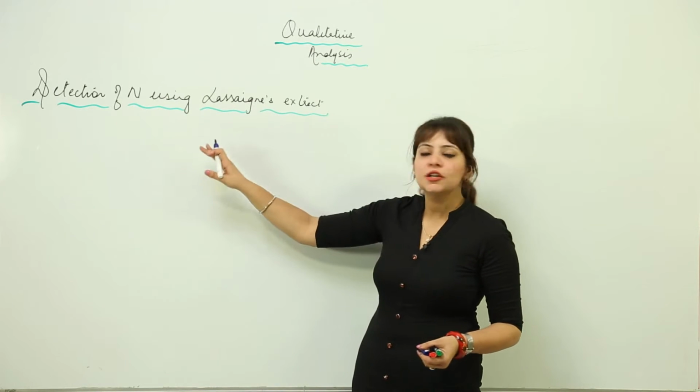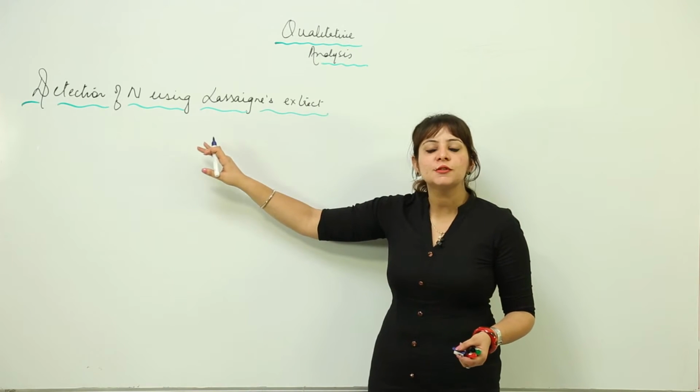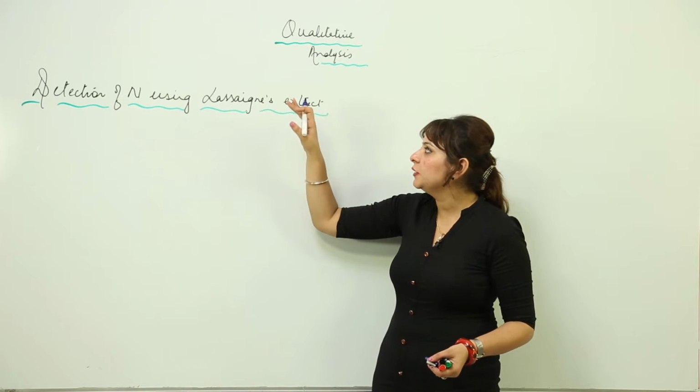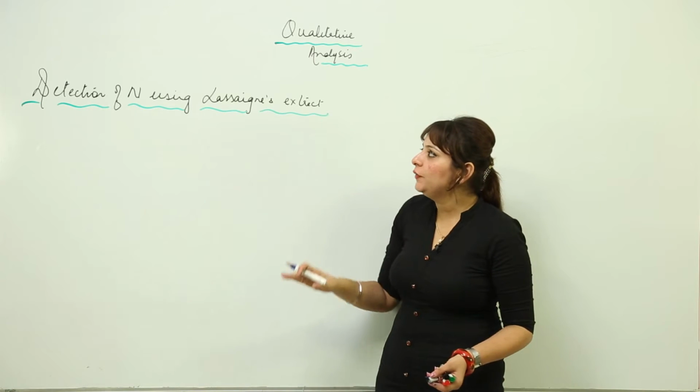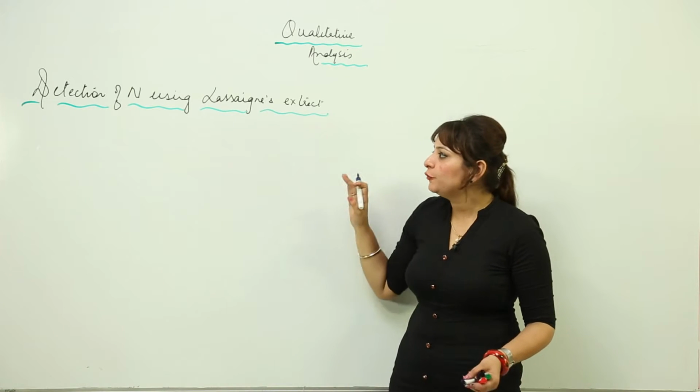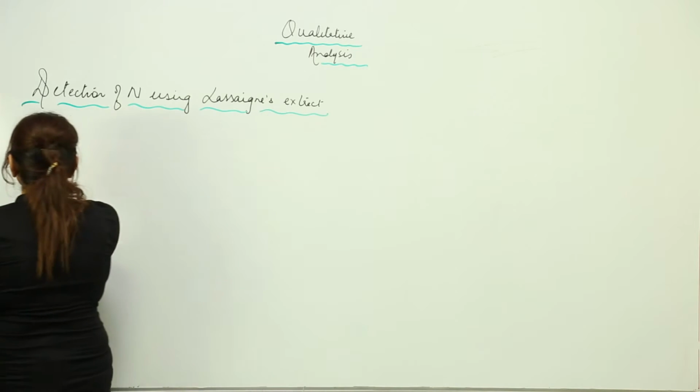This is a very important detection test, that is, the Lassaigne's test. By the use of Lassaigne's test we can actually detect many substances. So here we are going to detect nitrogen. The first step is to prepare the Lassaigne's extract.